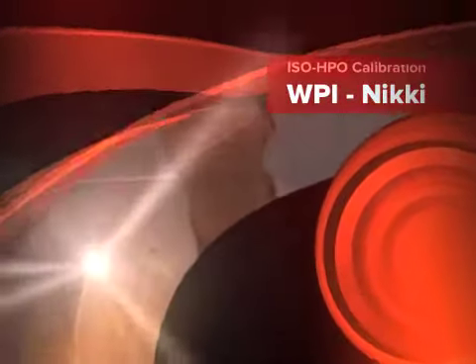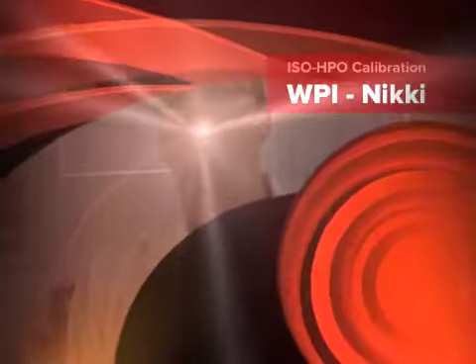Welcome back. Today we are going to calibrate a set of hydrogen peroxide sensors, our HPO100 to be specific, which is our micro sensor, and 100 because the diameter is 100 microns.